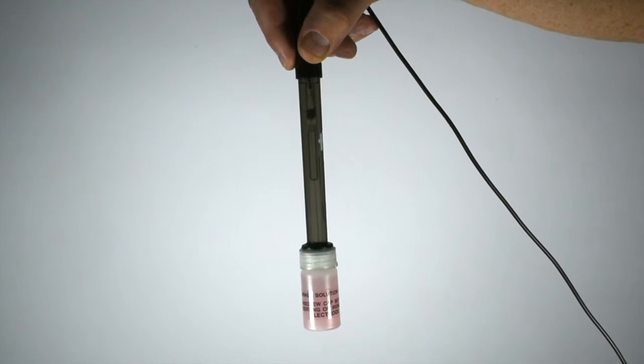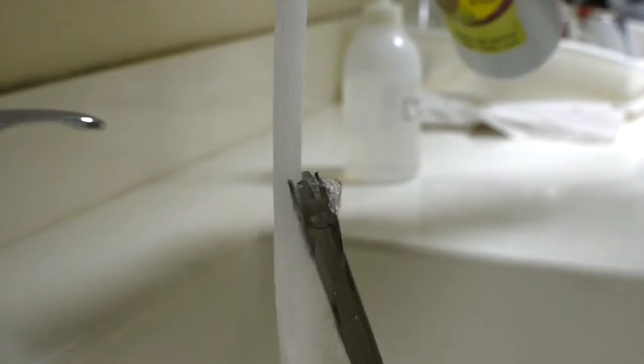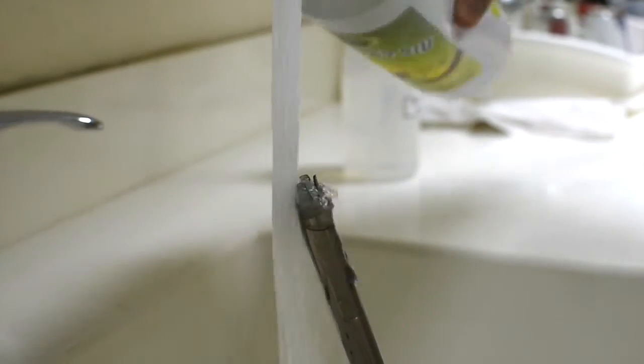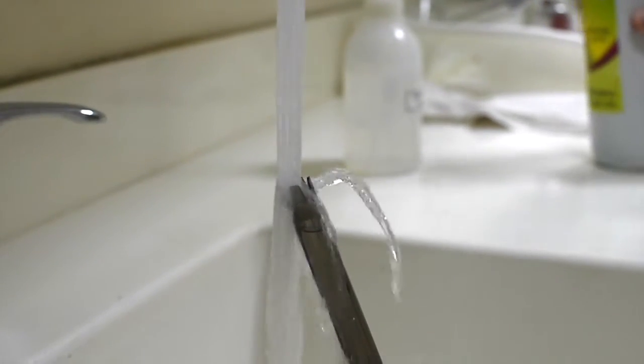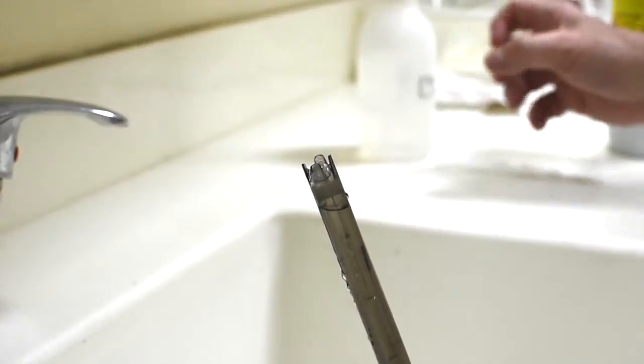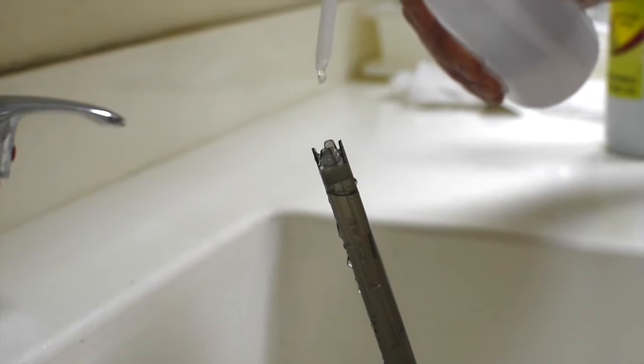Always store the electrode in its protective cap. If your electrode is covered with grease or oil, you can wash it with warm tap water and dishwashing soap. Then rinse with distilled water.